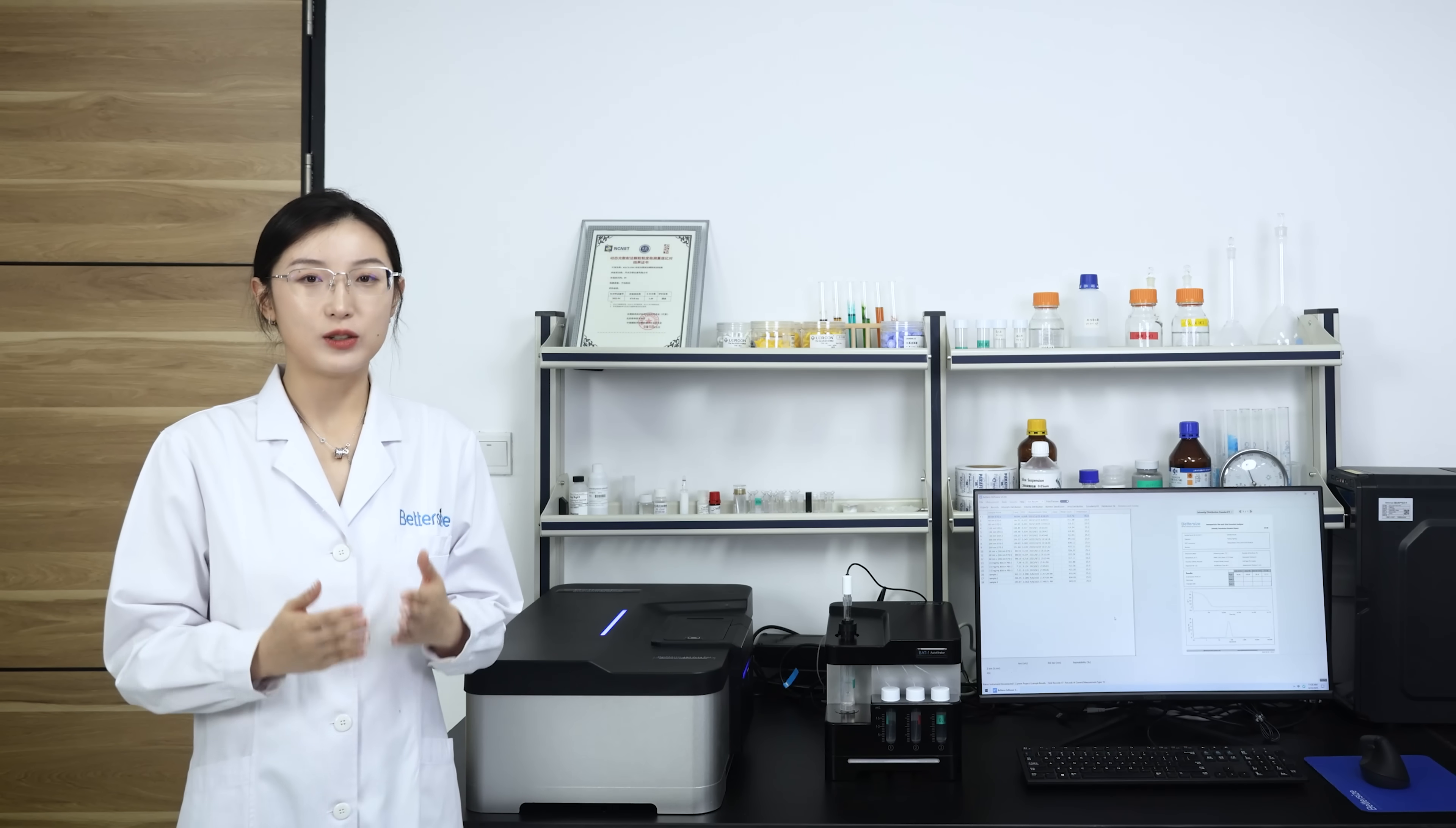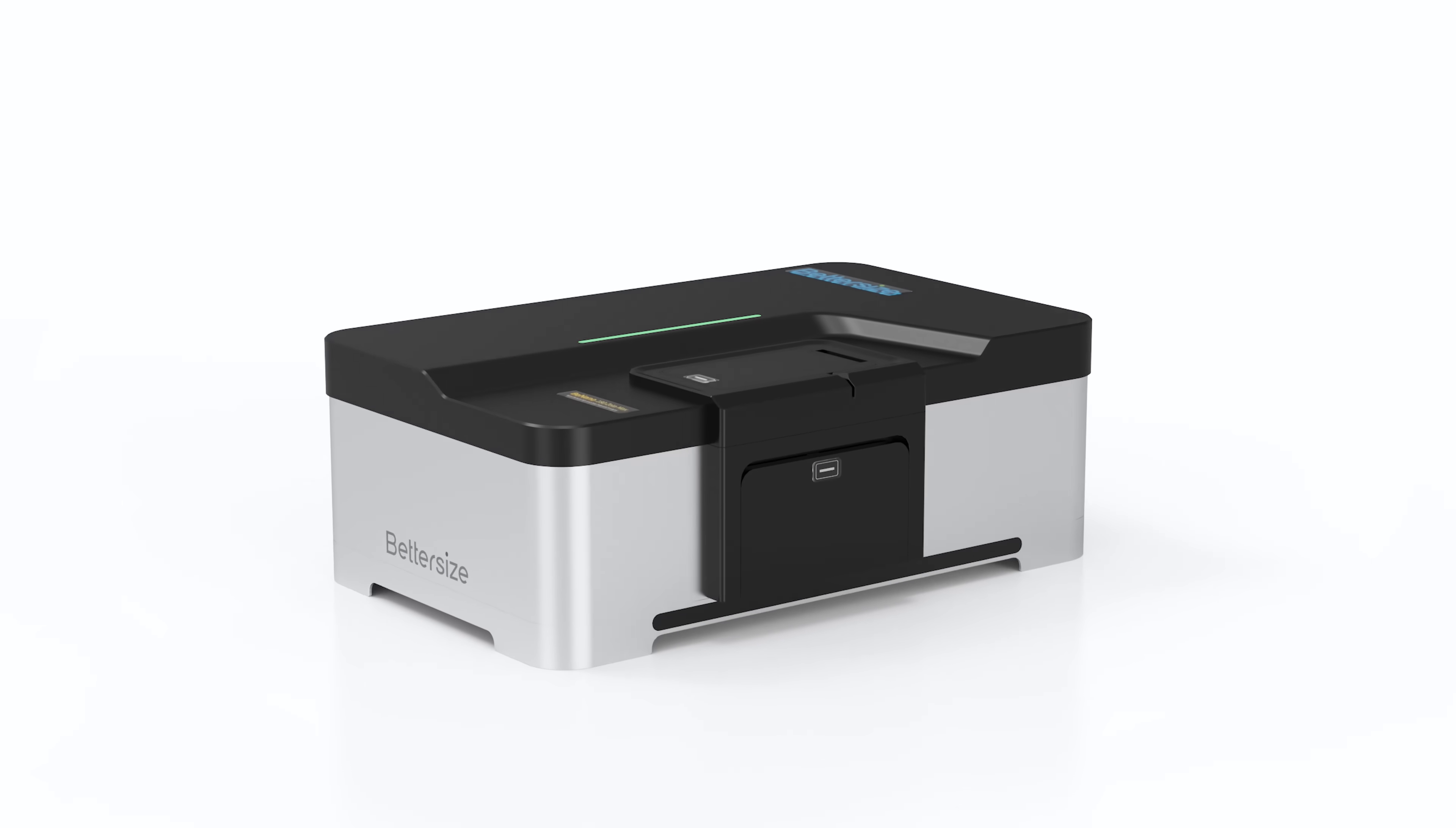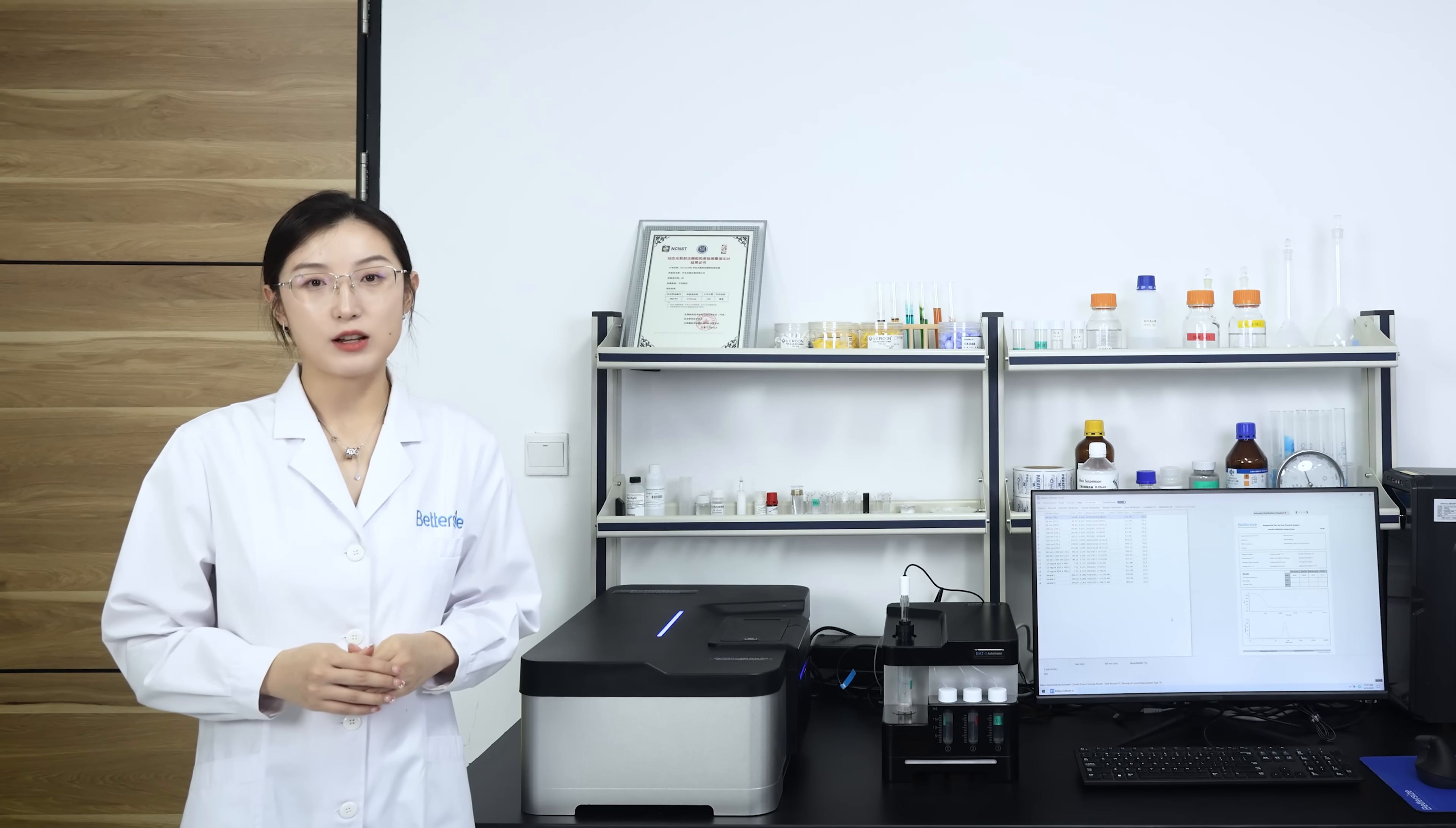Today, we are excited to introduce you to the BNANO 180 Zeta MAX, an advanced nanoparticle size and zeta potential analyzer. The BNANO 180 Zeta MAX offers an array of powerful functions.